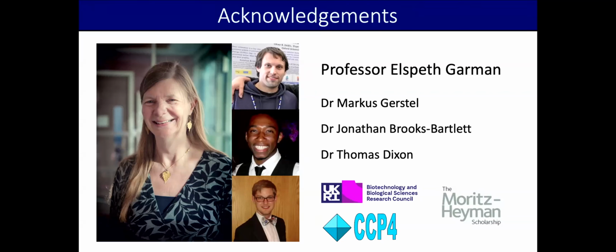Clemens von Rijn will be talking tomorrow about a way of catching in the data themselves indications of radiation damage. So it's a superset of what you did at the very end, using only the initial data to get better density. But if you compare the initial and the final data, you get a map of where electron density has disappeared because of radiation damage. That's been around for years as a feature of AutoProc, combined with Buster.